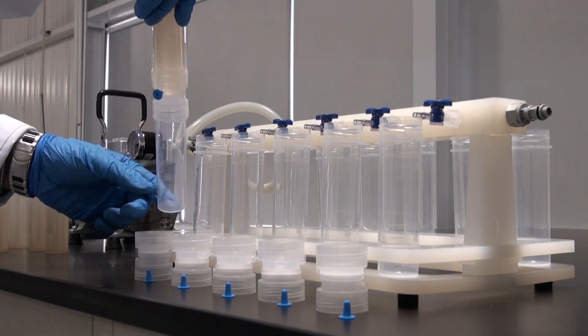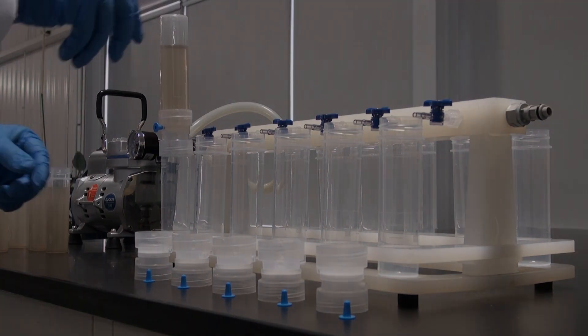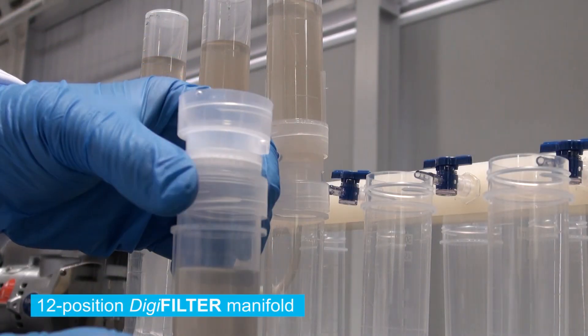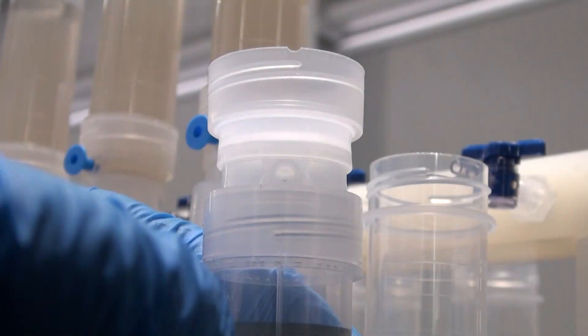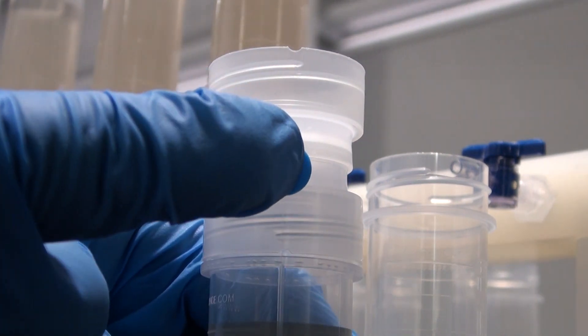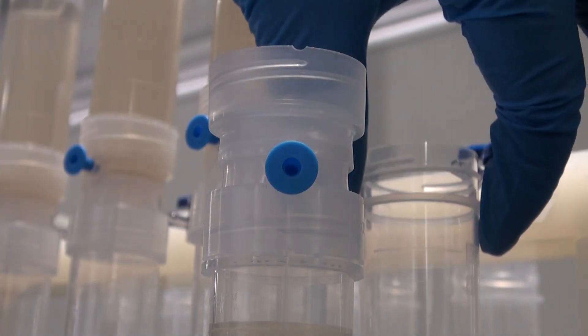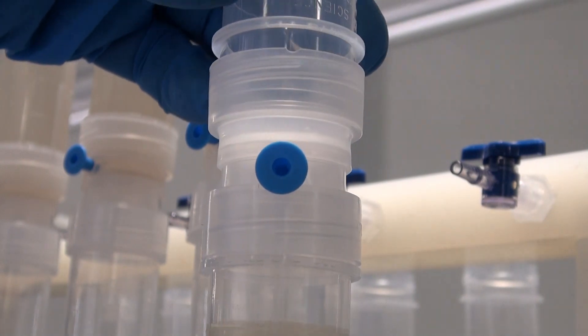Invert and connect the Digitube Digifilter assembly to the manifold, in this case a 12-position manifold. A 4-position manifold is also available, and they may be connected together in order to filter more samples simultaneously.